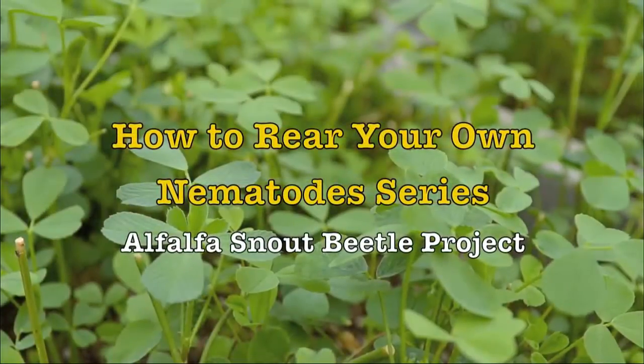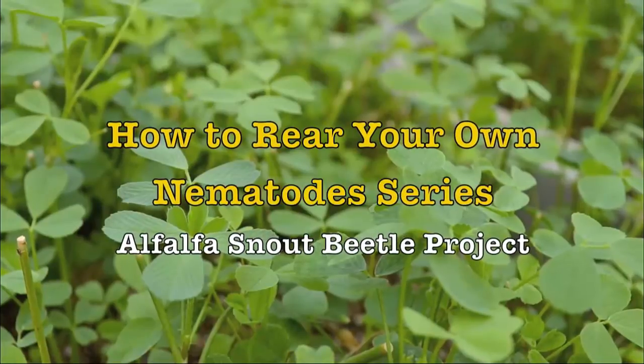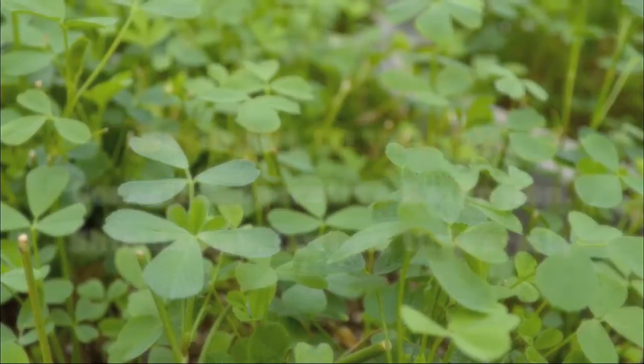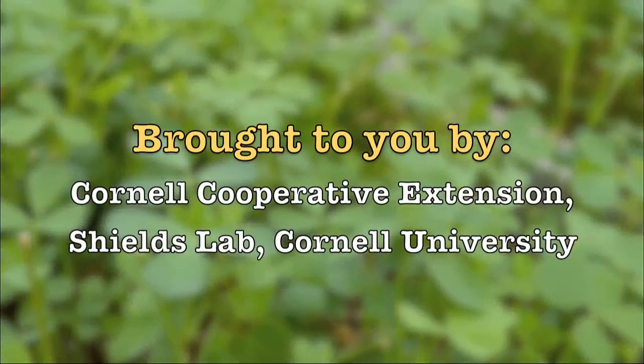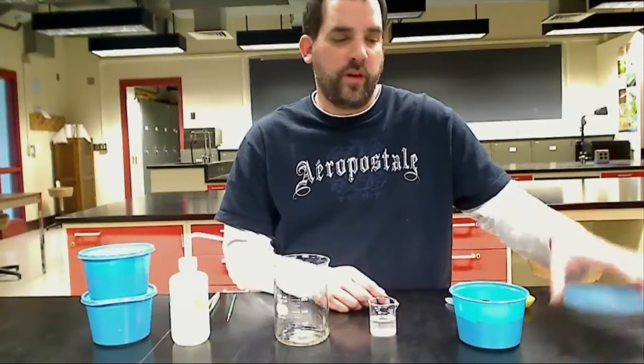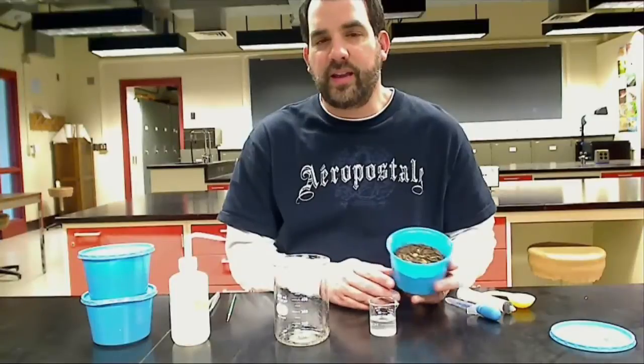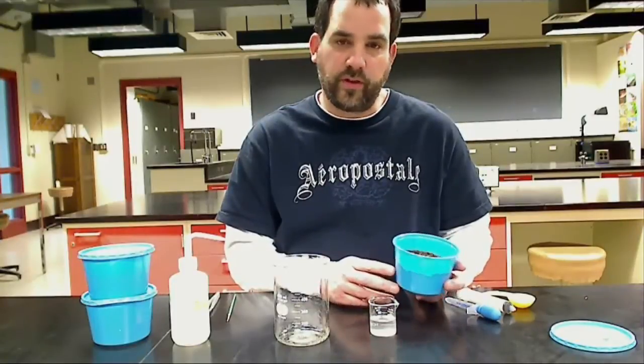How to Rear Your Own Nematode Series by the Alfalfa Snout Beetle Project, brought to you by the Cornell Cooperative Extension as well as the Shields Lab at Cornell University. Hello, and I'm here today to show you how you can inoculate your field cups for your field applications.